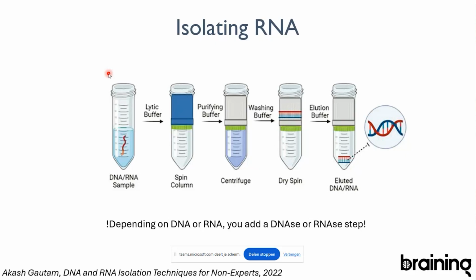You have some silica columns, which in the right conditions, bind the RNA. You can do a number of washing steps where the RNA is still bound on the column. That's what you can see here. And in the end, you use an elution buffer to get rid of the charges of the silica column, and you elute your RNA.